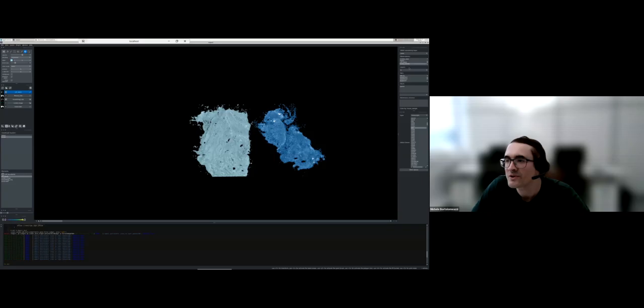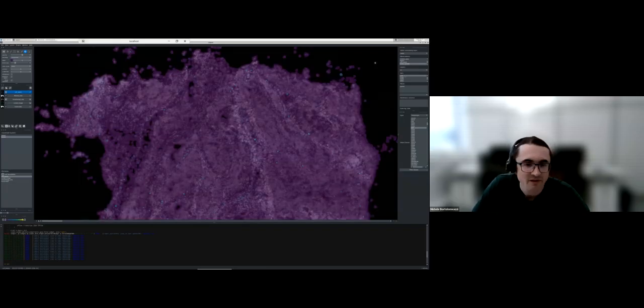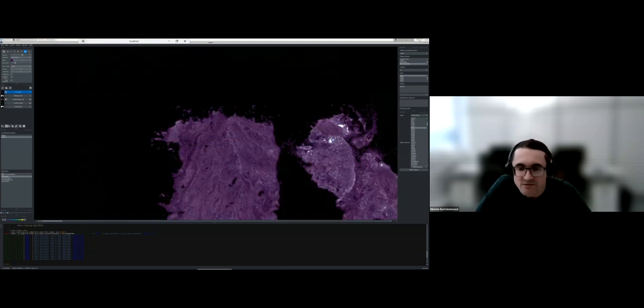And then, of course, again, we want to be able to explore something more that could be interesting. So then we can move to the gene expression. Now I am picking a gene, CD4, to select a nice subset of T cells.